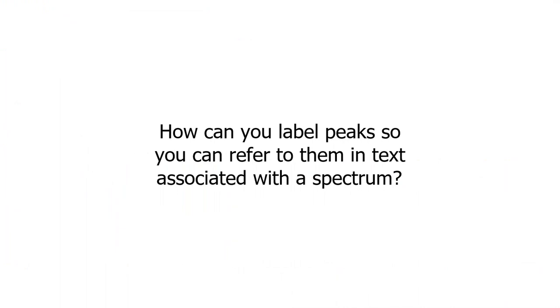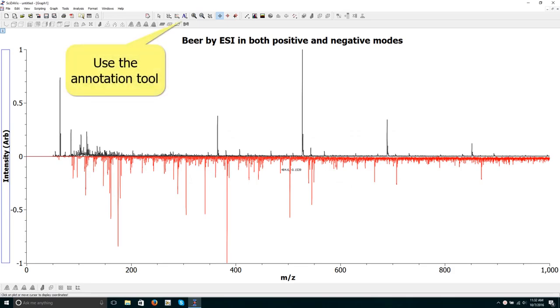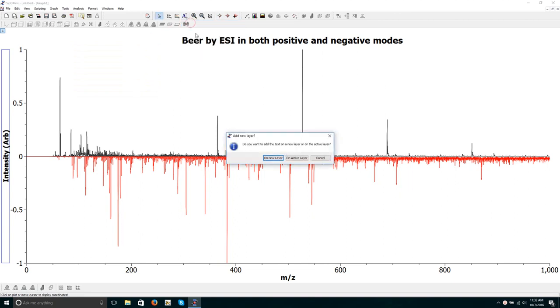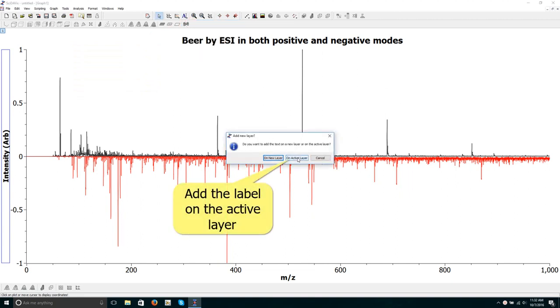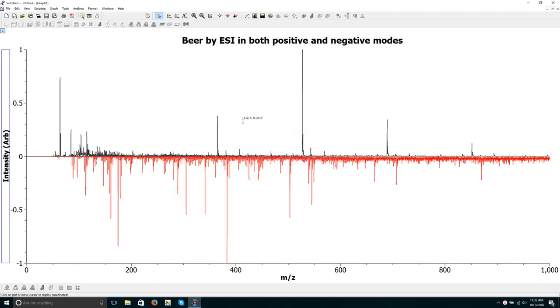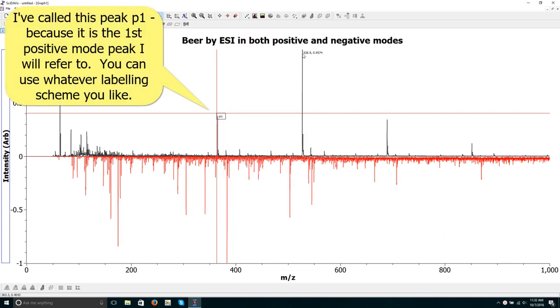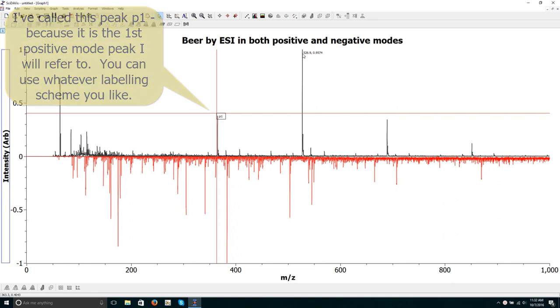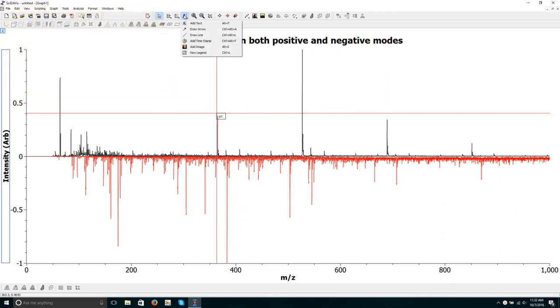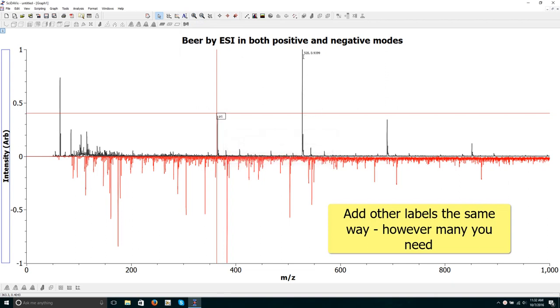How can you label peaks so you can refer to them in text associated with a spectrum? Use the annotation tool for this. Add the label on the active layer. I've called this peak P1 because it's the first positive mode peak I will refer to. You can use whatever labeling scheme you like. Add other labels the same way, however many you need.